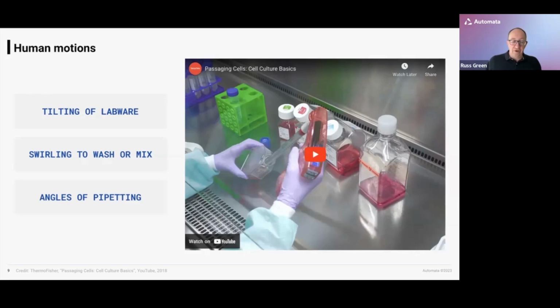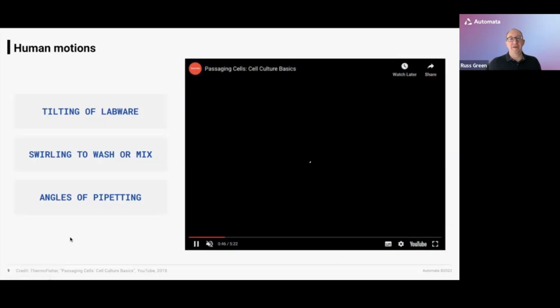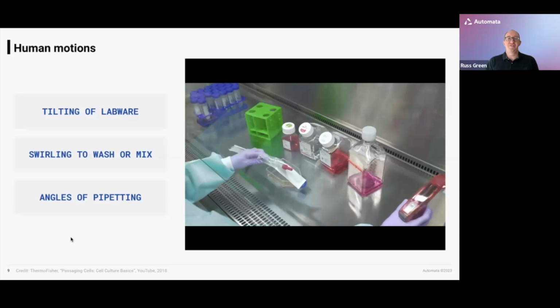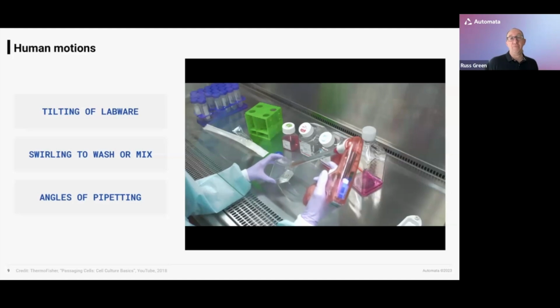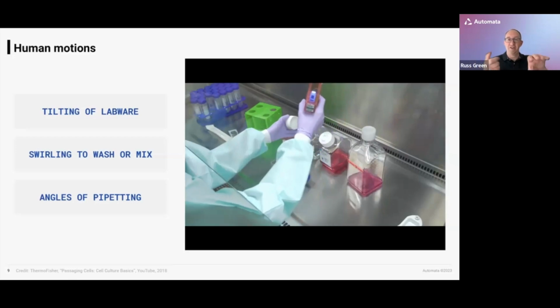So this ties very closely to the labware itself. I'm going to steal a video from Gibco, now part of Thermo Fisher, where they speak about the basics of handling cells, and in particular about passaging cells. And you can see as we go through this the kind of motions that are required. These are complex human motions that are hard to recreate in automation, well, not impossible, just difficult. So here we're tilting labware as well as going in with that long pipette, and we've got two hands moving things in a three-dimensional space.